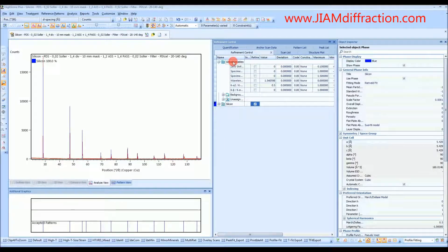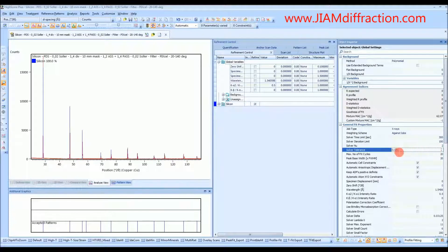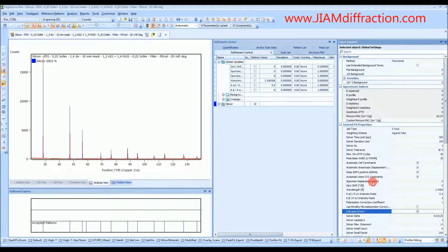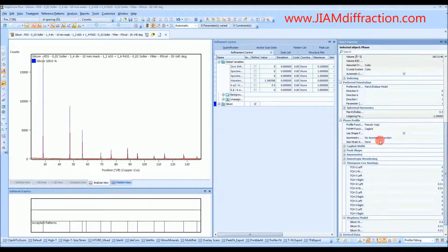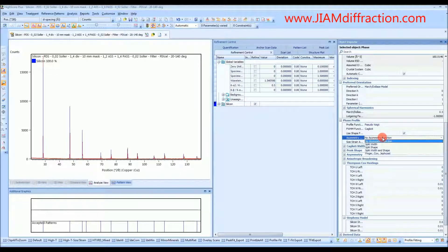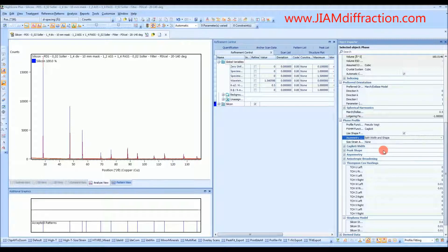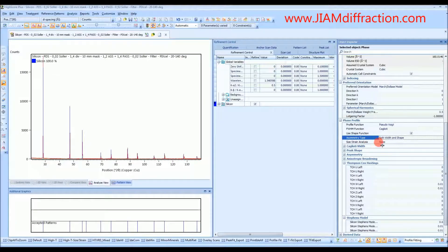Now we can move on to refinement control. The first thing we want to do is go to global variables. I suggest changing the tolerance — we'll add two zeros in there. Sometimes if you have a very complicated pattern this can be a bad thing to do, but with a simple pattern it seems to improve the refinement. We'll also tell the computer to calculate errors. Moving on to our phase, we have the option to set an asymmetry function. So in case your peaks are a little asymmetric, if you set a function it'll help shape them a little better — I like to do split width and shape. And even though we are doing a size-strain analysis, for this step we want to make sure that this says none.